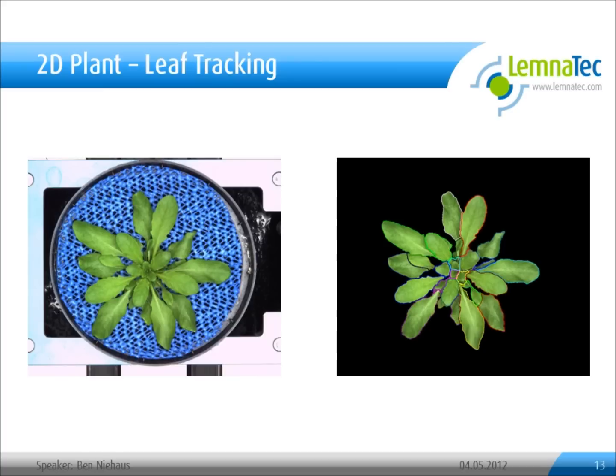To perform the same analysis on a flat plant — for example, an Arabidopsis plant — the skeleton algorithm is not suitable. Therefore, we need more sophisticated algorithms.